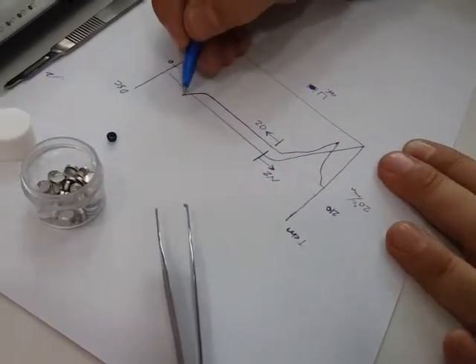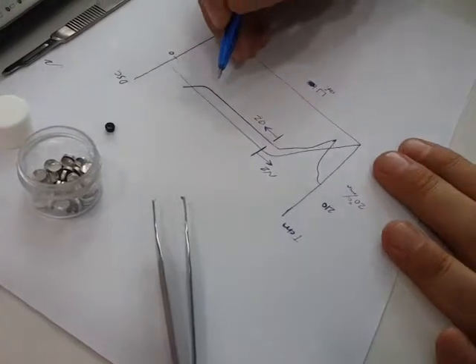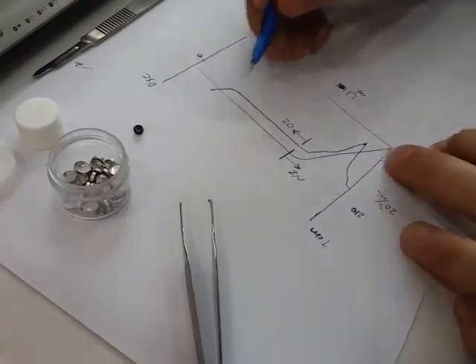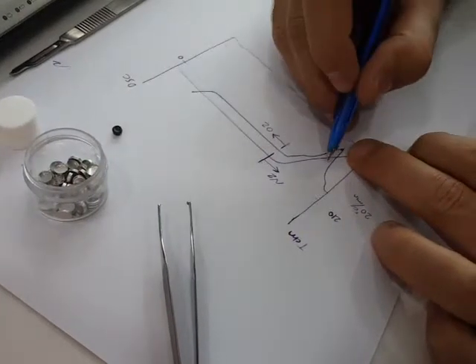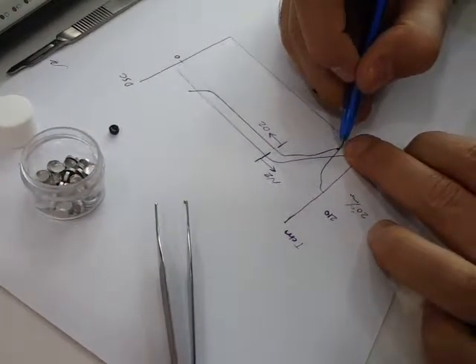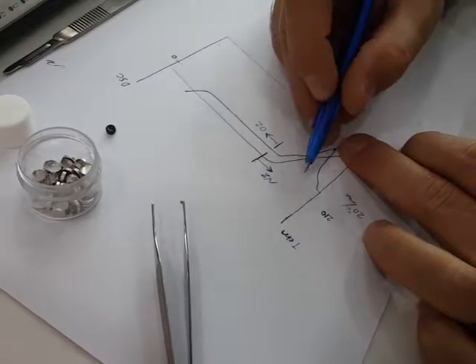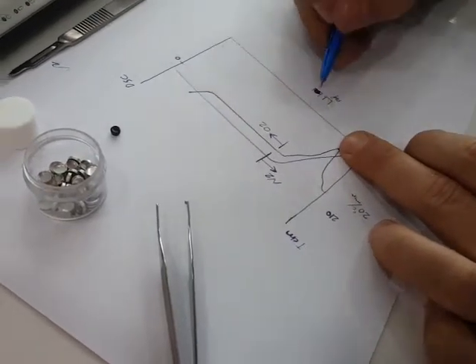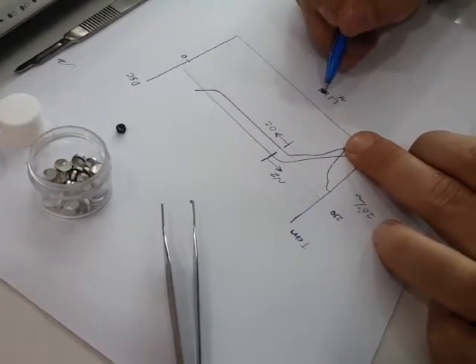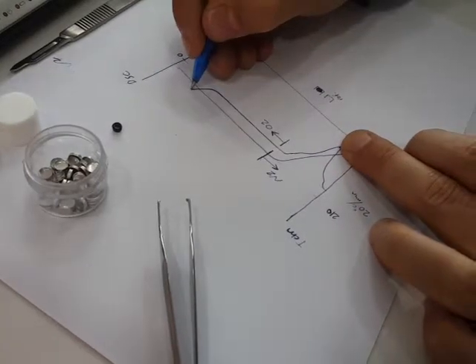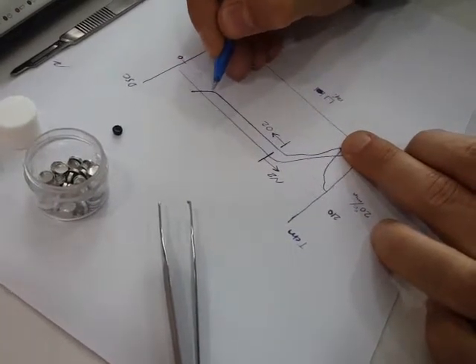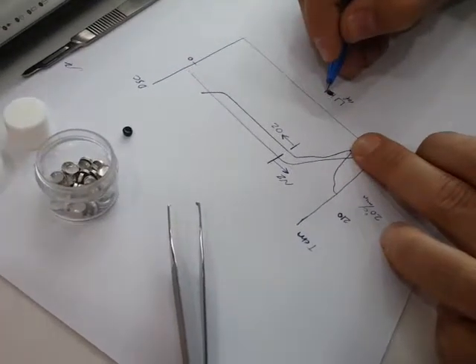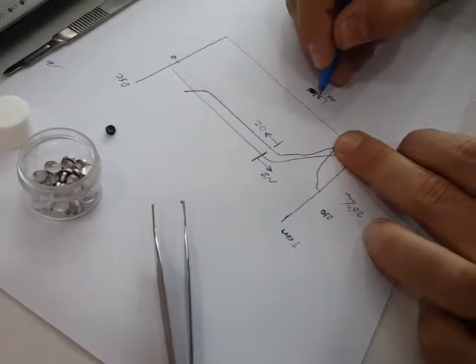This is actually energy that sample delivers to the surrounding area. This is reverse comparing to the melting section, because in melting section the DSC will be dropped because sample is absorbing energy from surrounding area. And when it's being oxidated, it delivers energy to the surrounding area and sensor sees this energy.